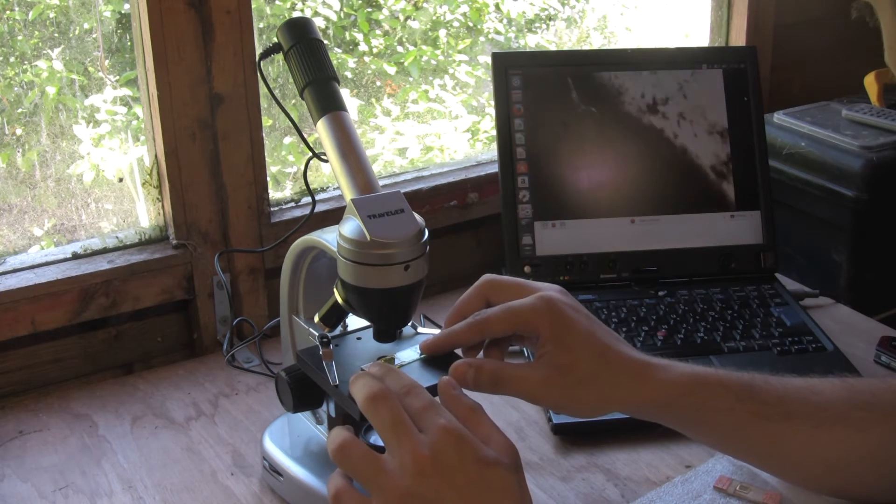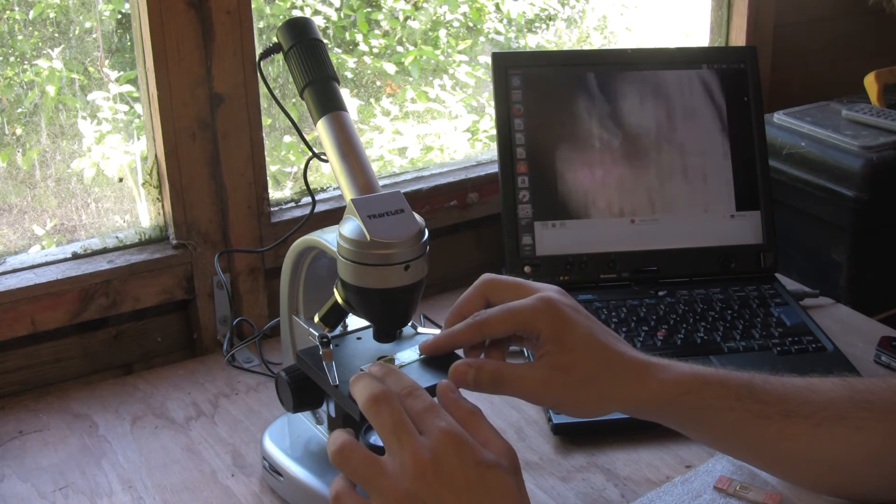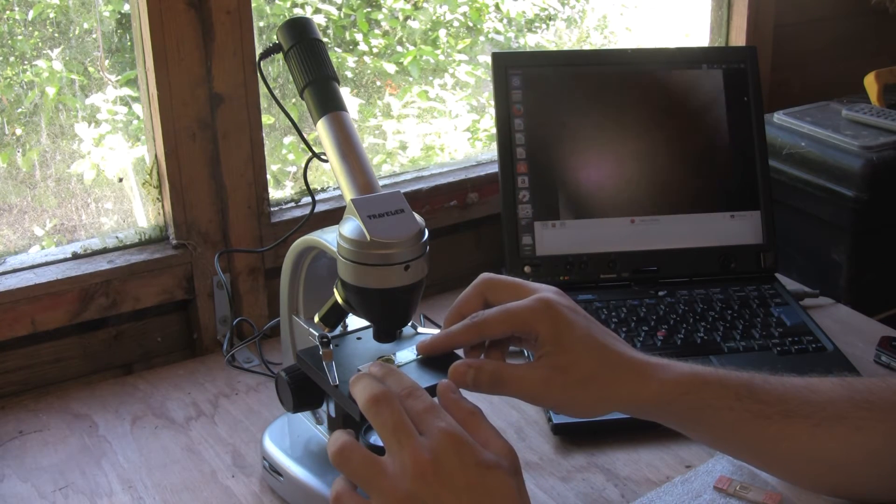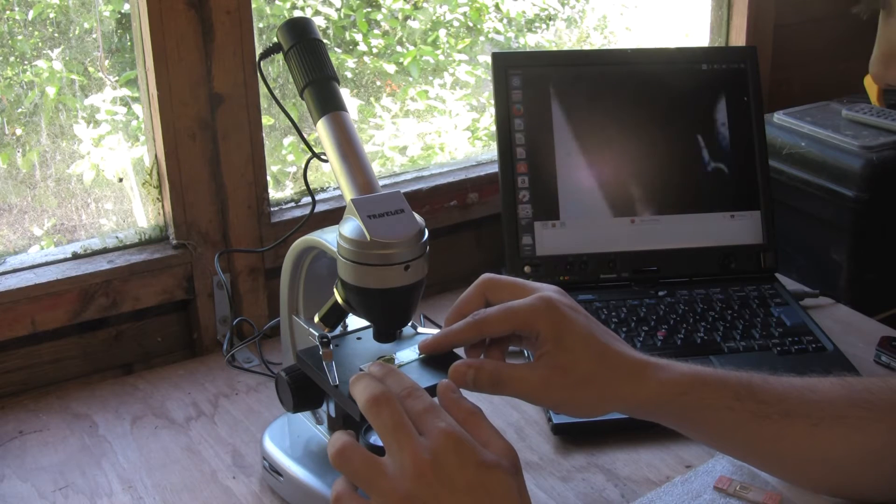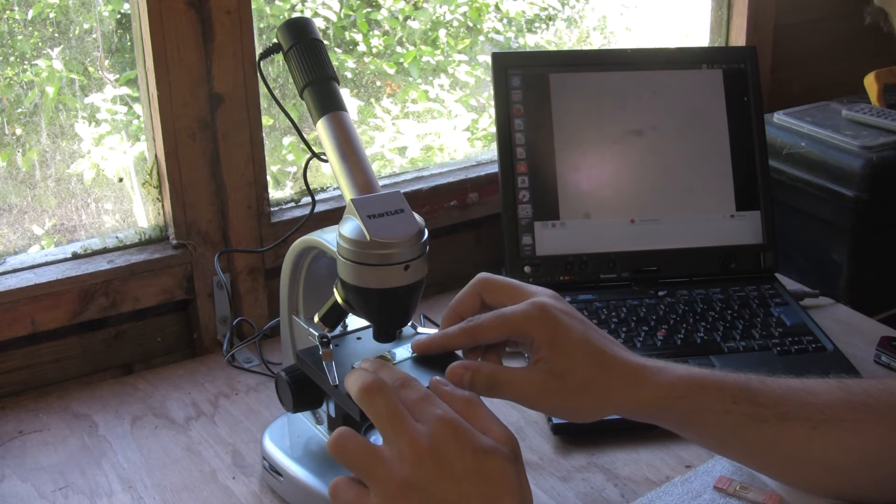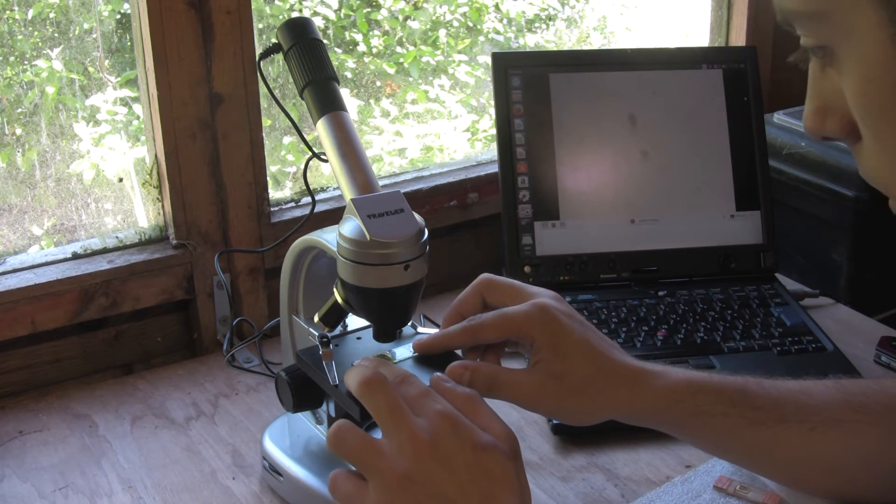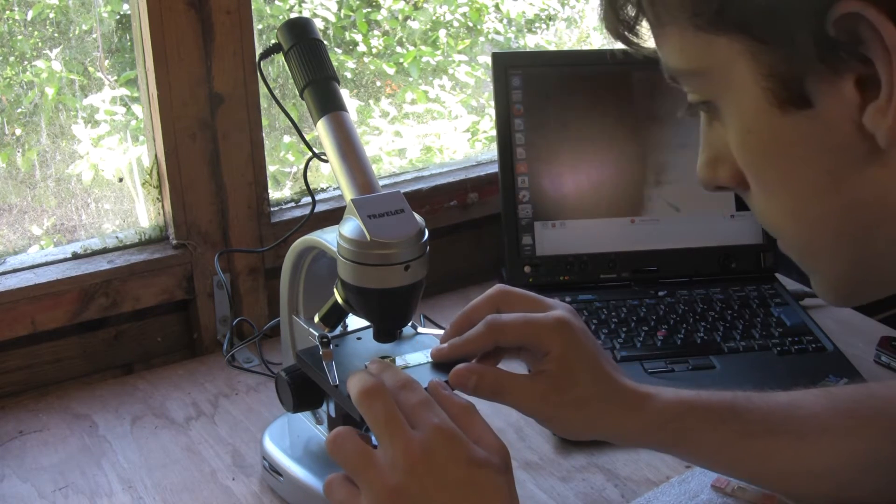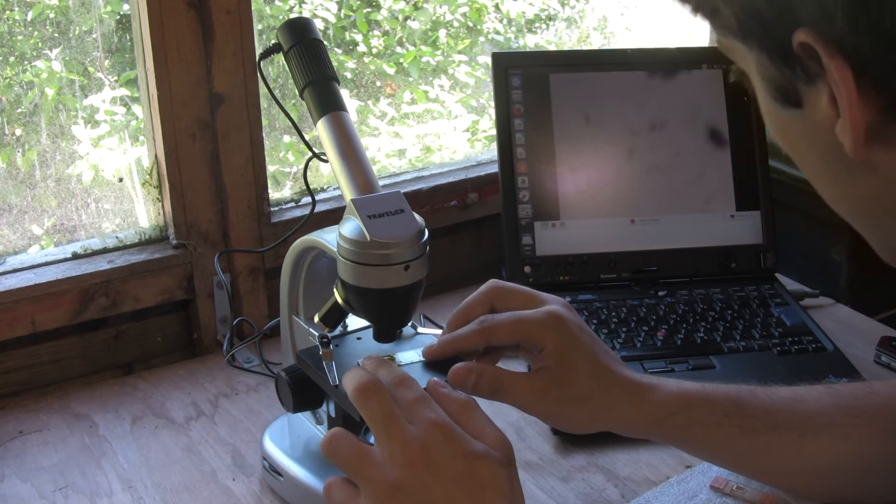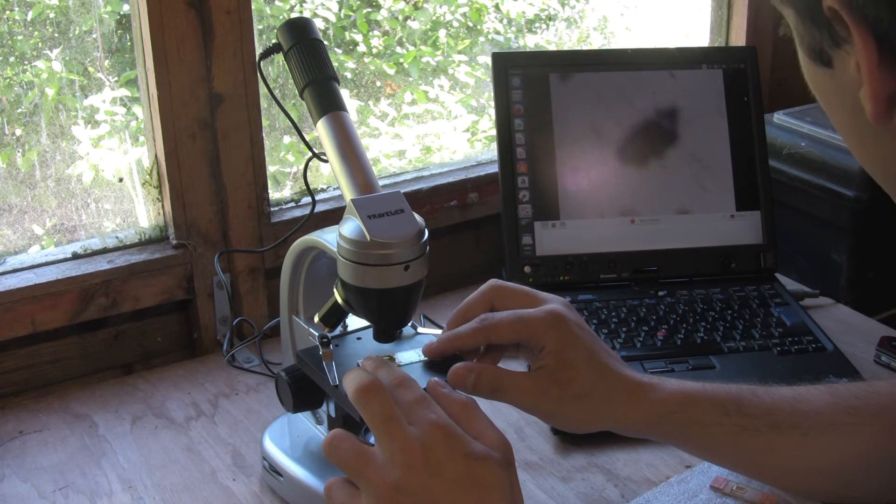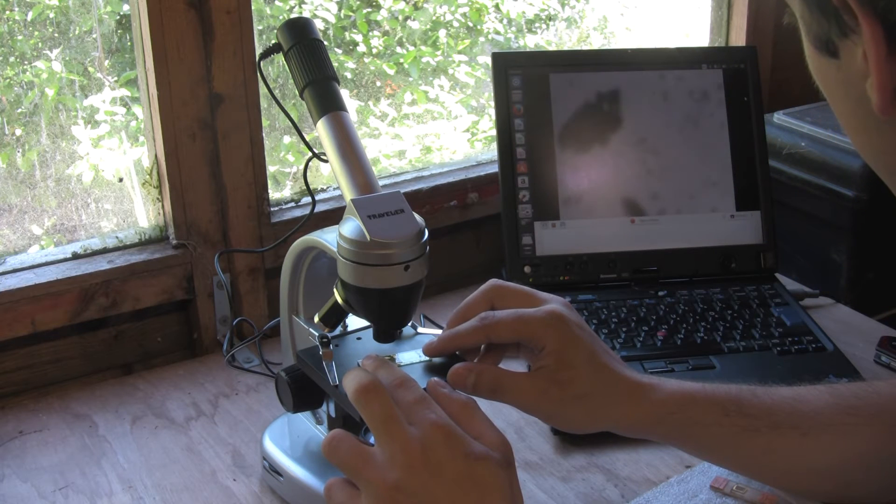So I've stuck the microscope on its lowest magnification. That's about four times magnification. Is that it?